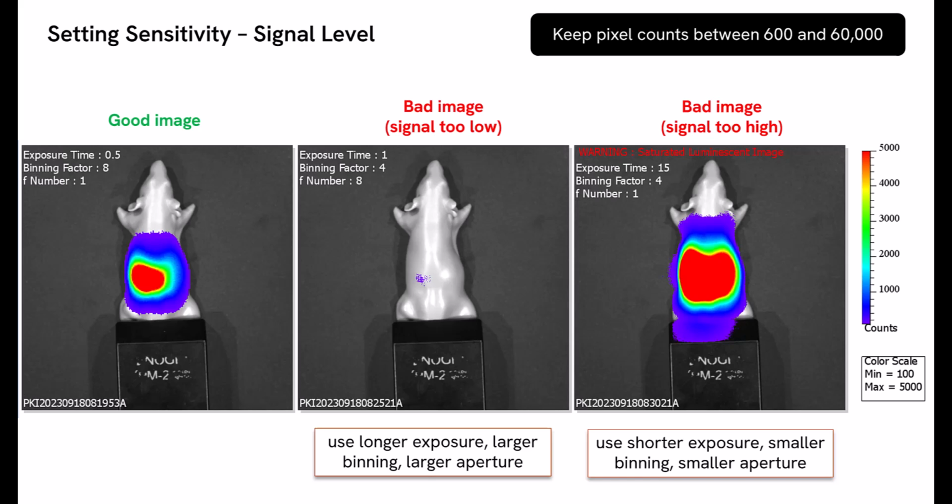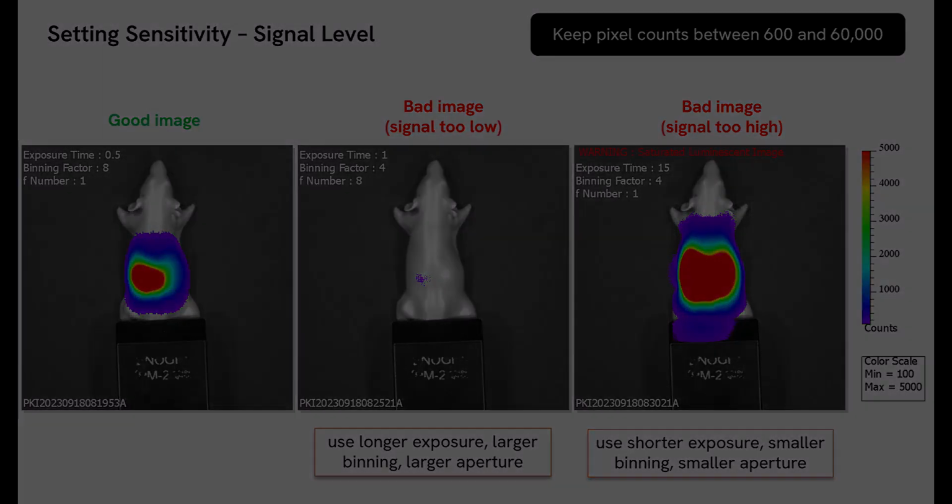By using the Auto Settings tool, the software will automatically optimize the settings for the brightest signal in the field of view. Therefore, we highly recommend that you use this feature.